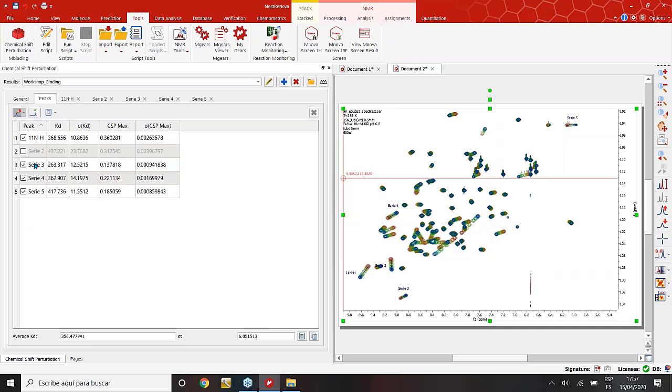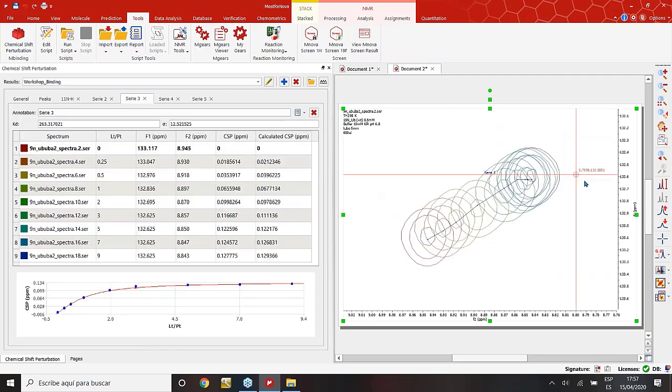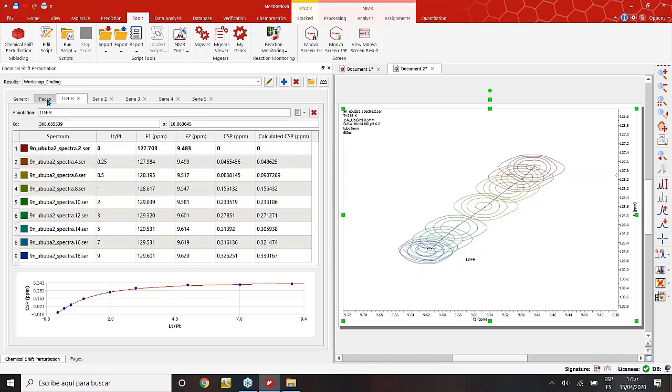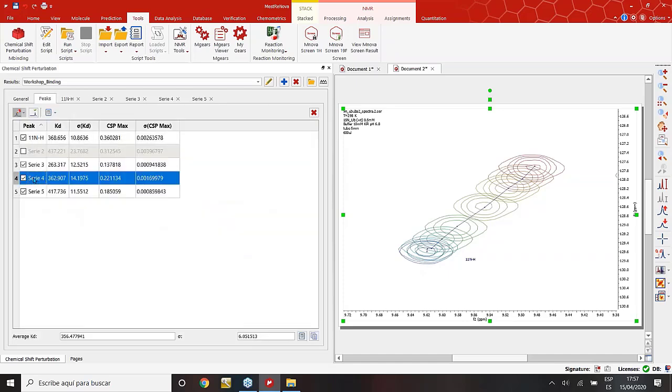If you want to check any of the series, you could just double click on it and the series will be expanded for your analysis, for your review. So you could go back, you could check the series or whatever.